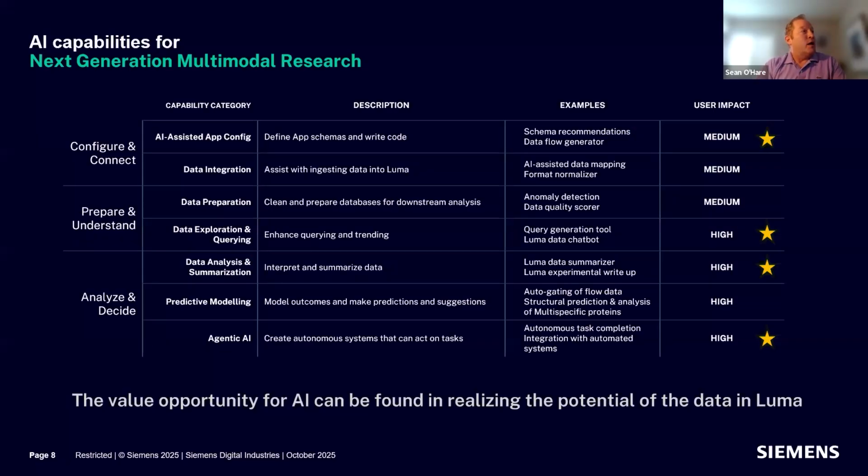I'm not going to read through this slide, but I'll point out a couple of things here. So having an agent in place is really different than having a large language model. A large language model is the underlying intelligence of an agent. Agents then add in skills, tools, really specific task-based workflows that it can perform.